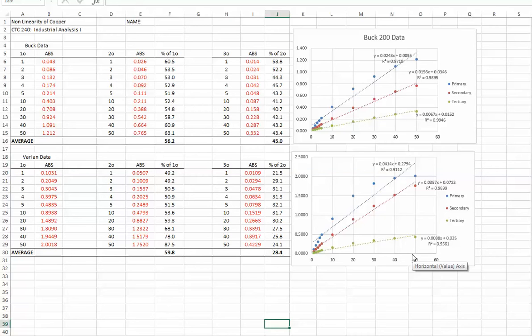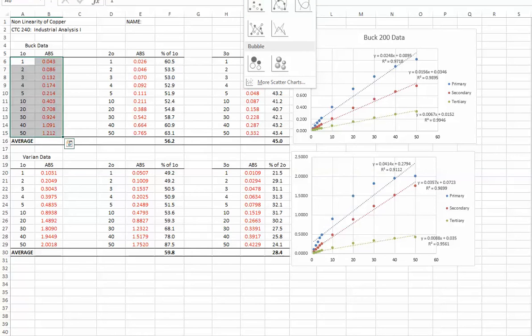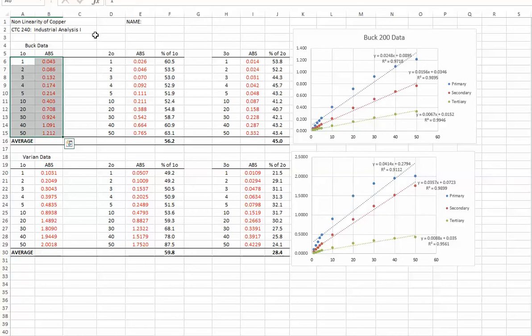What we need you to do is take a look at your copper standards and plot them just like a regression line, but you do that using the scatter plot feature. Again, I'll put my concentrations in the first column and my absorbance reads in the second column. I will highlight those two columns, go up into the top and hit insert, then hit scatter plot and choose the one that's only for the dots itself. Do not connect them with a line. That's not the purpose of plotting the data. We just want you to plot the data.